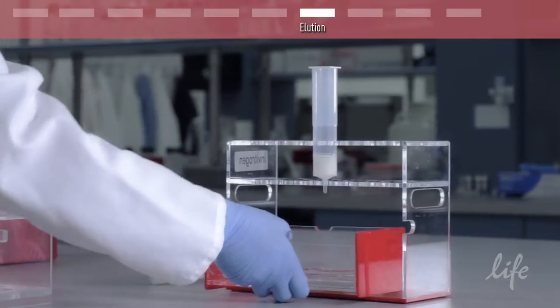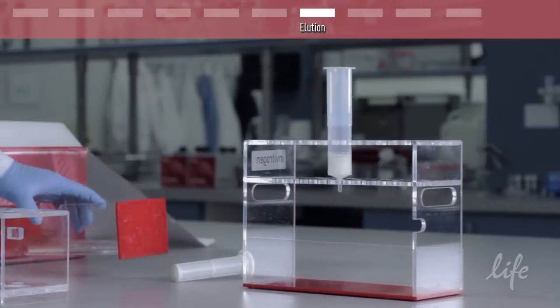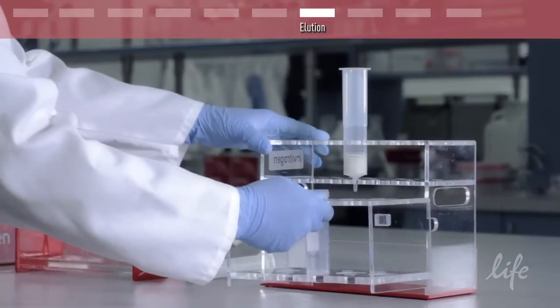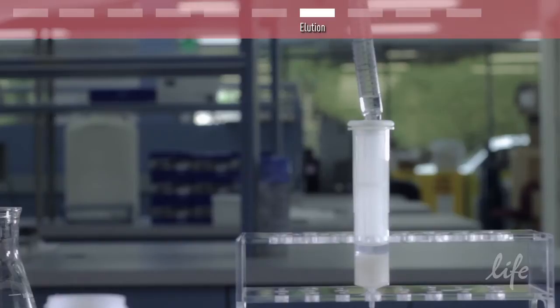Elution is the final step to release the plasmid DNA from the column. Add the elution buffer to the column and collect the eluate.